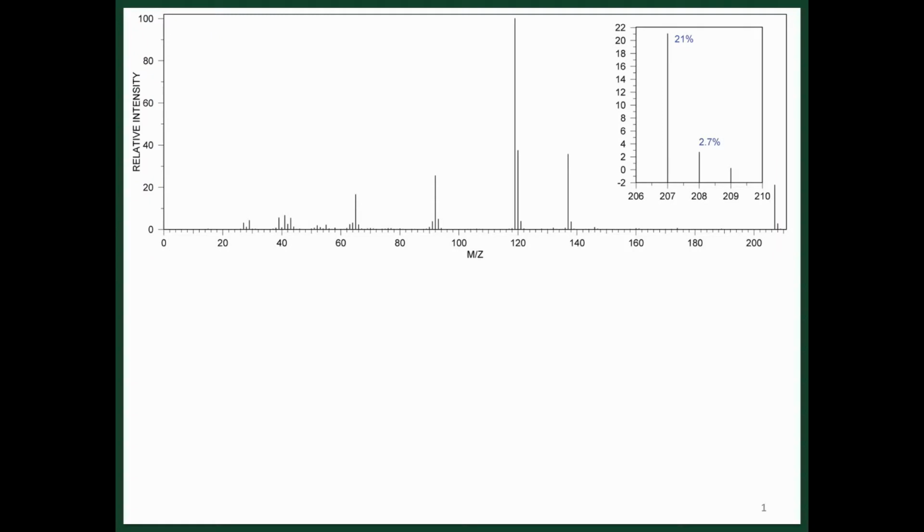All right, so at this point in organic chemistry, we've learned a number of different instrumental techniques. First off, we've learned mass spectrometry. For mass spectrometry, you should be able to determine the molecular weight of a compound. So using this technique, we're able to identify what our molecular ion peak is, as well as obtain some information about the number of carbons and elements in our sample.